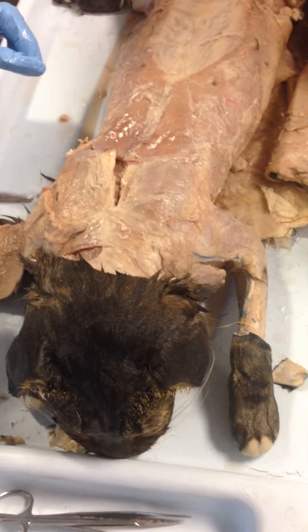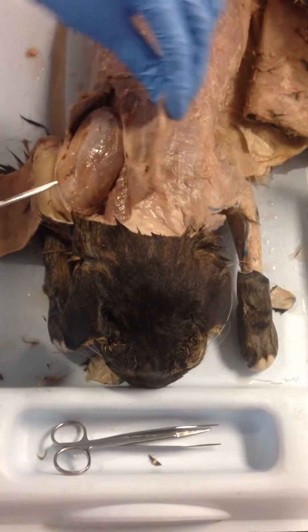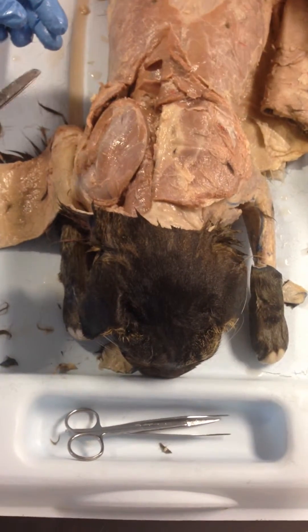This right here — you can see it runs all along the back. I'm going to reflect the trapezius on the right side, just underneath that.